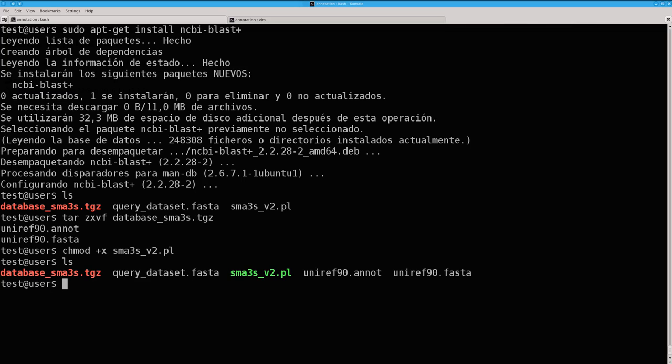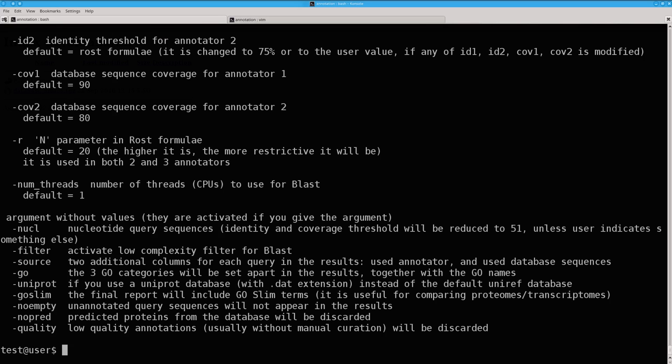Now you can execute, at this moment, the SMAS3s.pl. If you do it without any argument, you will see a short help document describing the different arguments you can choose.